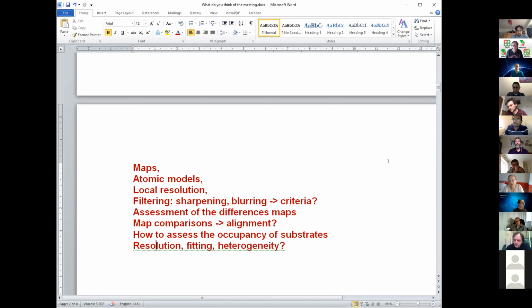And on this level, from my point of view, in the previous hours' sessions, it turns out that half of our group is mostly related to the assessment of the atomic models, understanding what's going on, and half of our group is closer to EM data. And so far, everybody was absolutely obsessed with getting high resolution, 2 angstrom.